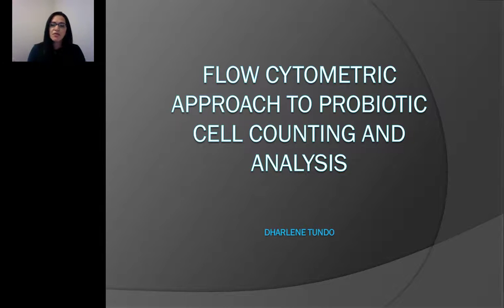The reason we decided to look into this new approach was to optimize the timing, because this is a great benefit for the industry, especially when production of probiotic supplements or other products is in high demand for large-scale production.